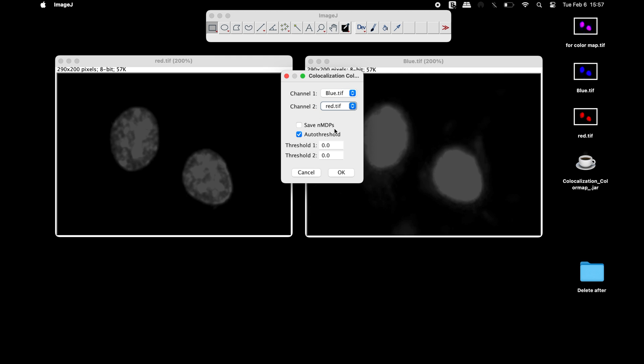Users may also choose to save the normalized mean deviation products, that is NMDP. Select the auto threshold option. We will also explore the manual threshold method in the later part of this video.